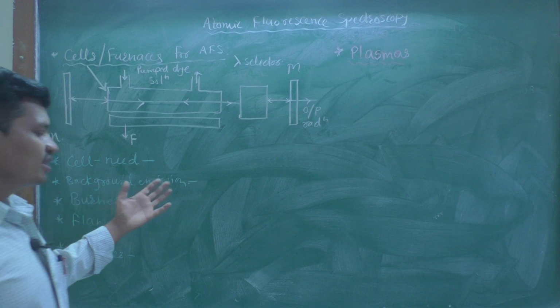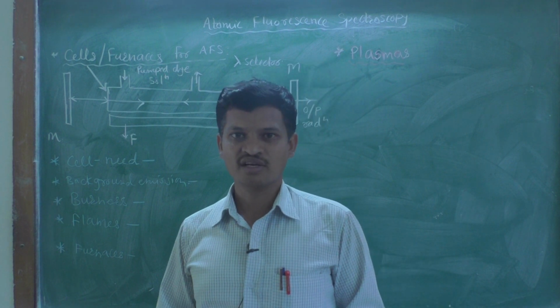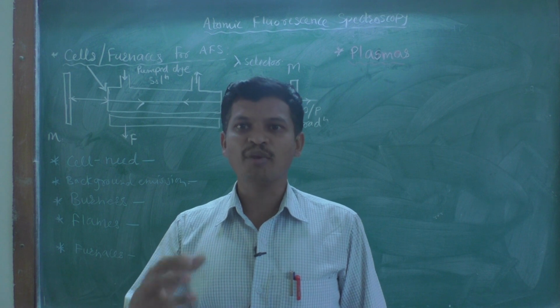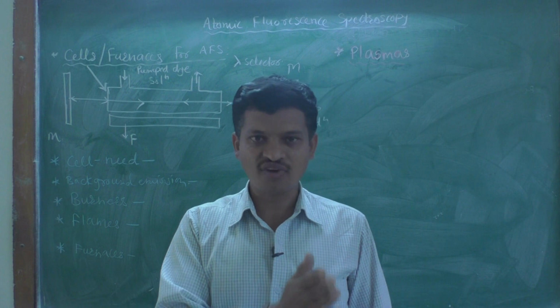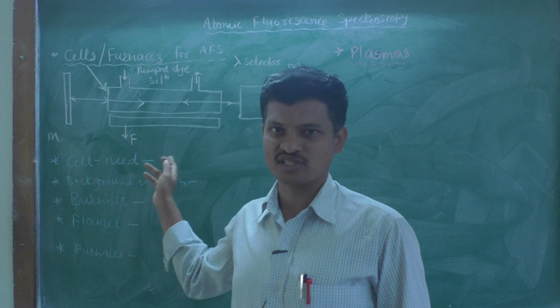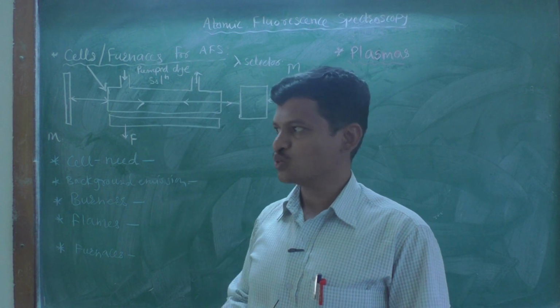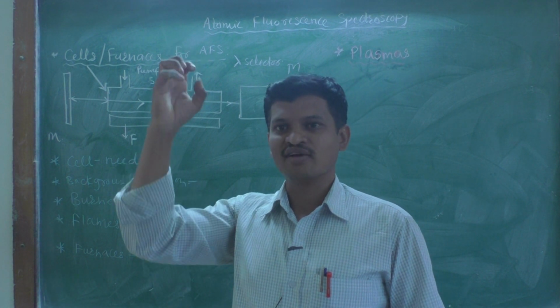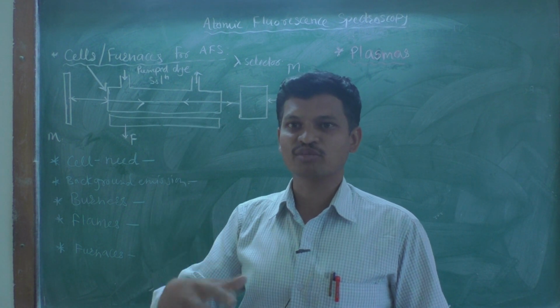Then there may be a chance of background emission due to thermal excitation. Due to thermal excitation, the atoms of our sample may get thermally excited. Thermal excitation is different from the excitation of atoms by the flash lamp radiation. Thermal excitation means the atoms of our sample get excited by capturing heat, by a gain in the temperature of the system.